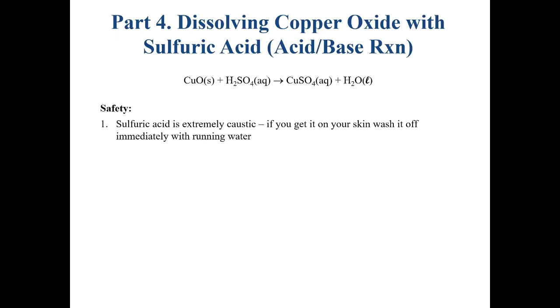So sulfuric acid is extremely caustic, and one of the things that you'd be paying attention to in the lab is that you wouldn't want to get this on your skin, and you'd want to wash it off if you did.